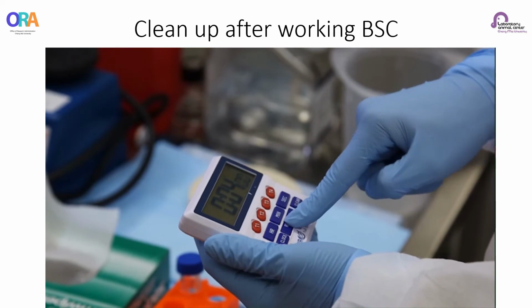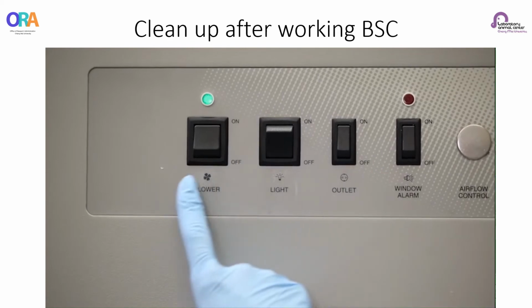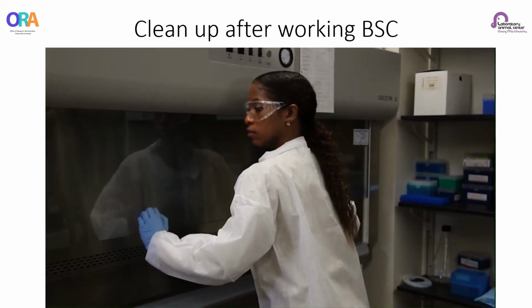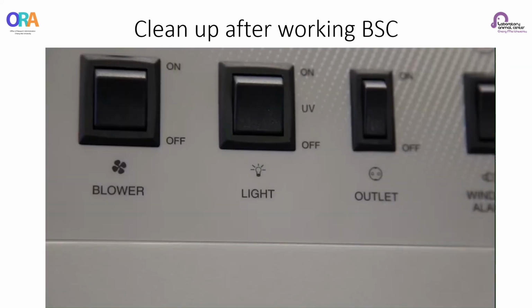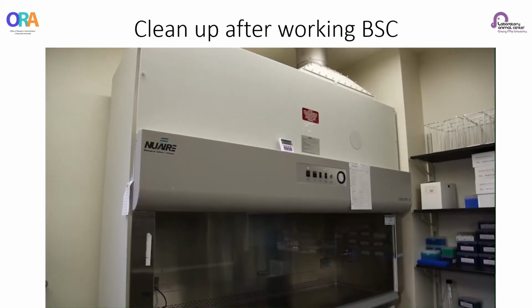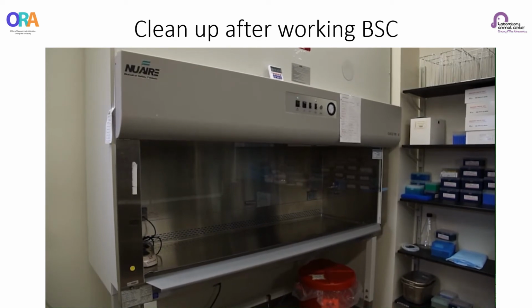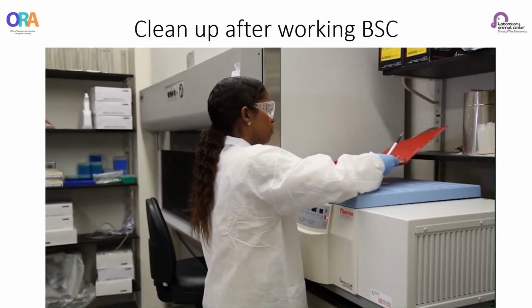Leave the blower motor running for at least 4 more minutes to purge the air. After 4 minutes, turn off the lights and blower and close the sash. If you have a UV light, you may or may not turn it on, as per your SOPs. Some labs will leave their BSC blower motor running continuously. In that case, you could turn off the light, but leave the sash open. If your lab keeps a usage log, be sure to sign the BSC log form.